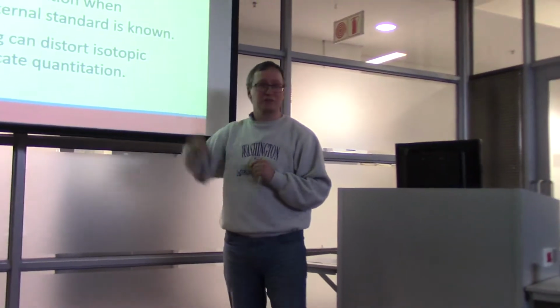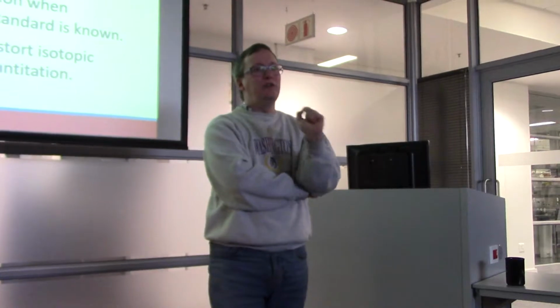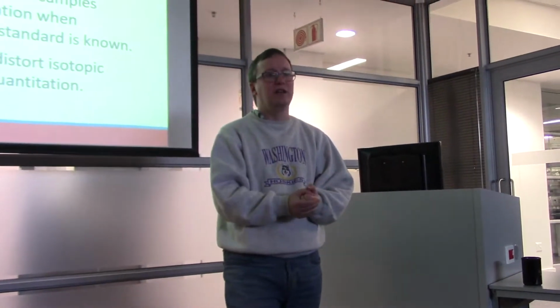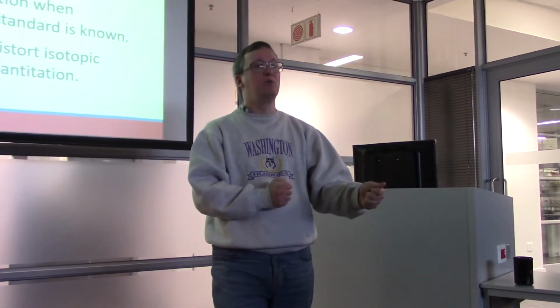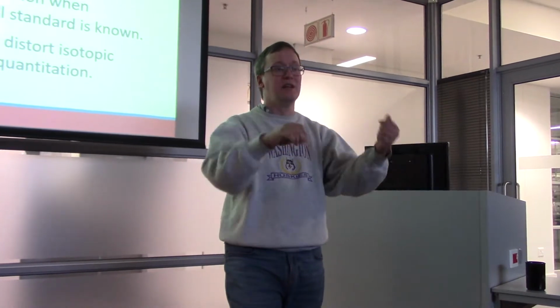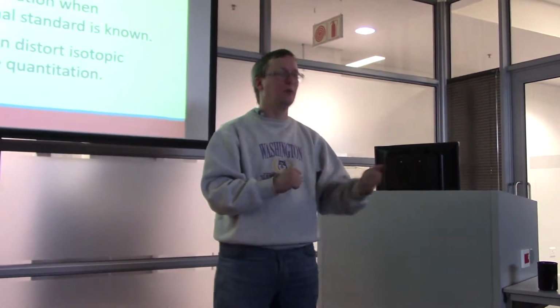All right. Now, I would note that there are lots of things that could go deeply wrong. Imagine that when you did your heavy water digestion of your protein, you had only 90% heavy water and 10% light water. That means you'd have a 10% chance every time a digestion took place of incorporating an ordinary OH rather than a heavy OH.